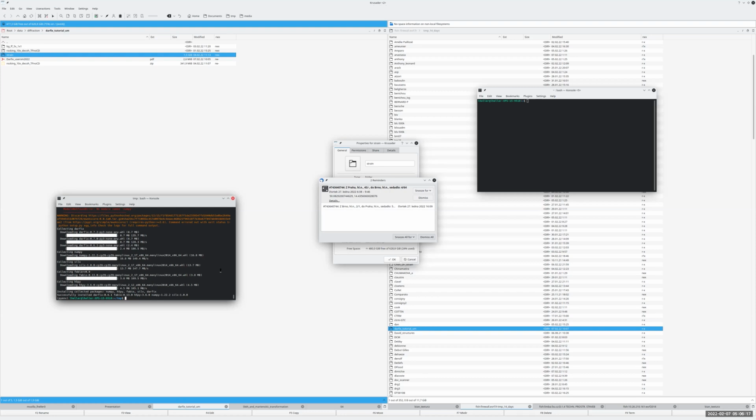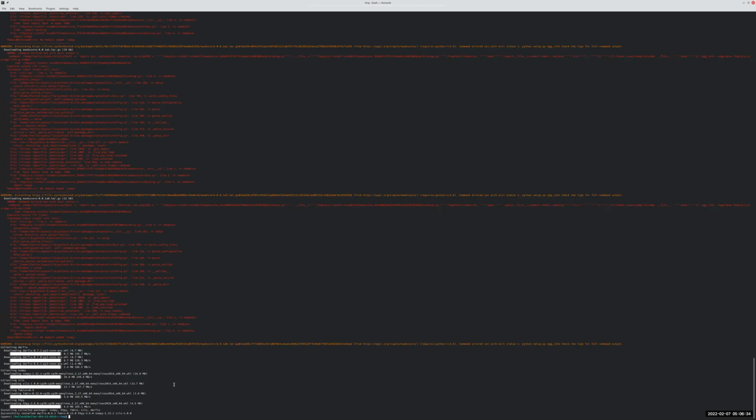0.0 download. You see here? Yeah, but we see very little 0.6. Can you make your command window a bit bigger? Yeah, sorry. Okay, but oh, okay, no, it's fine. I think Control plus made it bigger.